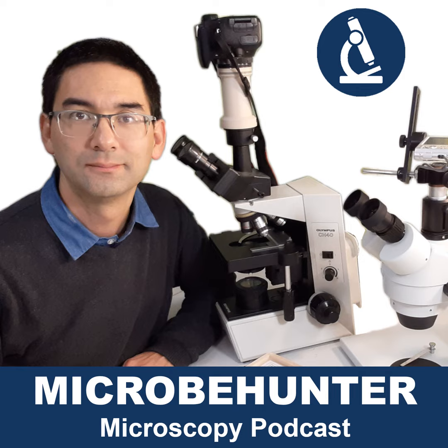Okay, so there is really the modularity that you have nowadays by having a separate camera, a separate laptop, a separate microscope, and simply connecting them together. You have so much flexibility and modularity that essentially I do not see any advantage of having a microscope with a built-in screen. So that's the thing. Okay.